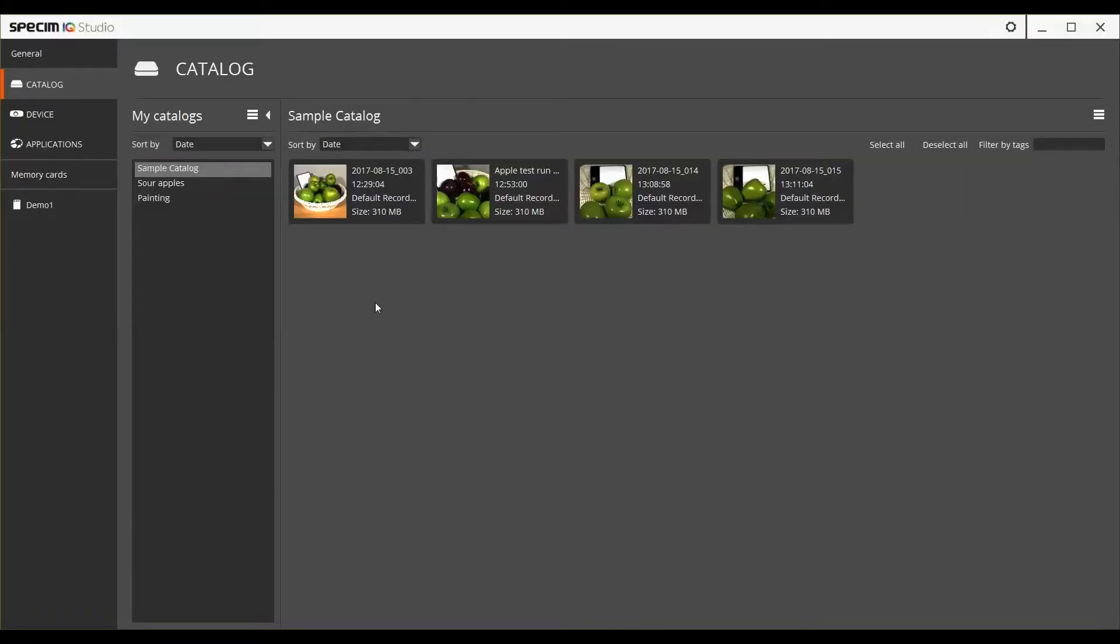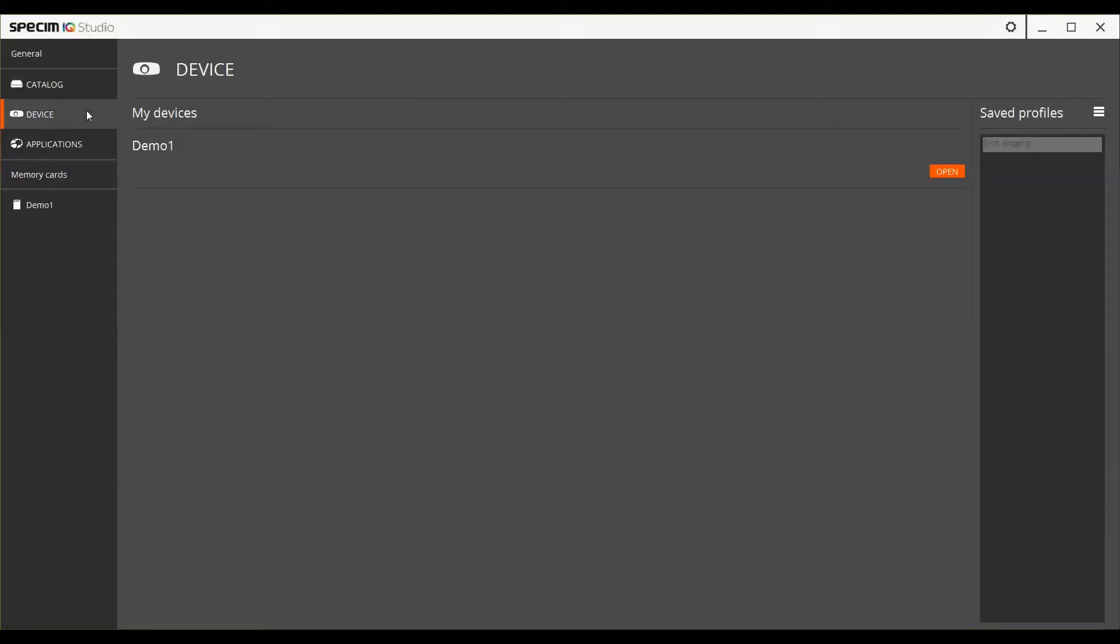All of the main functionalities are available on the leftmost bar. Under the label General you will find the sections for Catalog, Device and Applications.